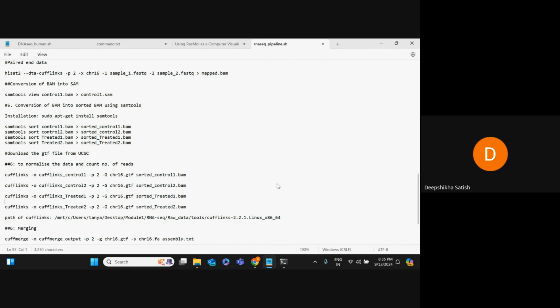Okay. So actually, Cufflinks is a very important tool for studying gene expression, alternative splicing, or maybe gene regulation. Why? Because it provides valuable insight into the transcriptome. Basically, it is assembling the fragmented RNA sequence reads into continuous transcripts and accounting for alternative splicing and gene fusion here.